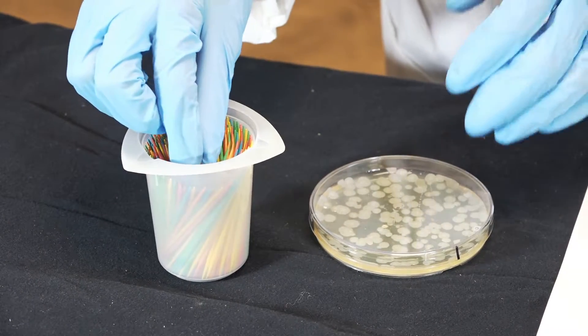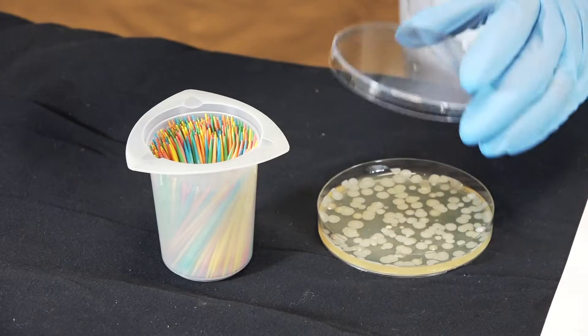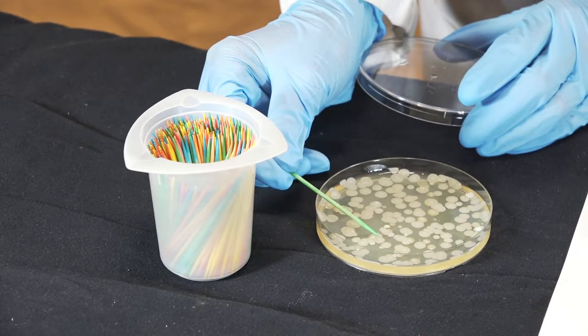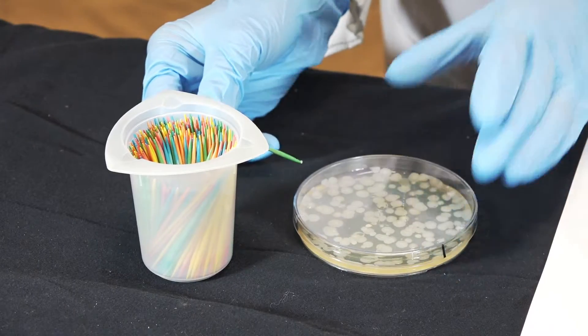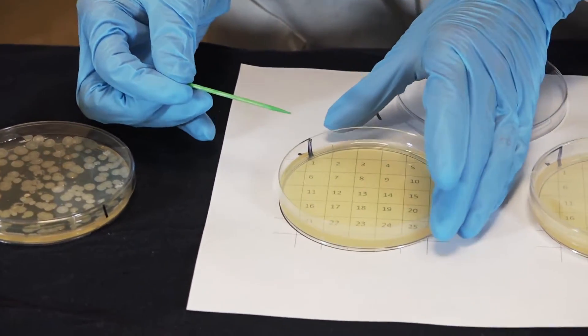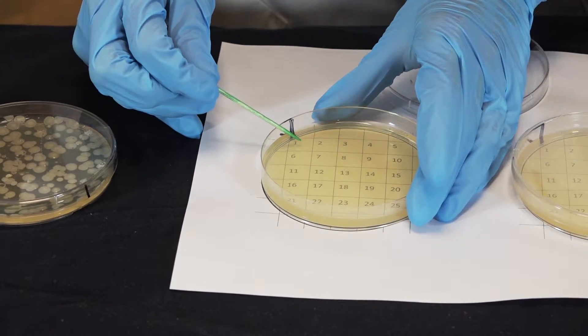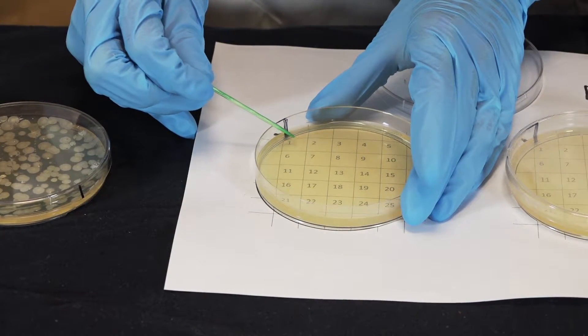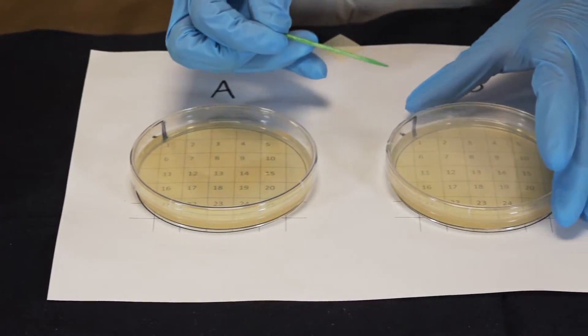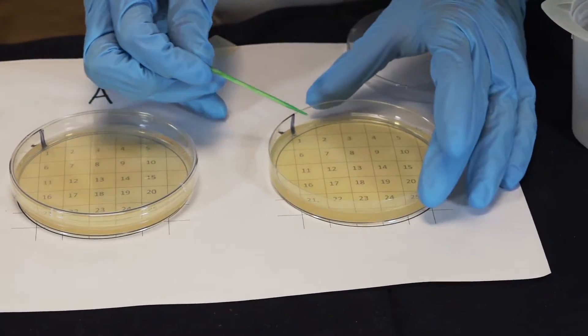We're going to use a sterile toothpick and pick a colony from this plate. Then we're going to inoculate square one on plate A and square one on plate B.